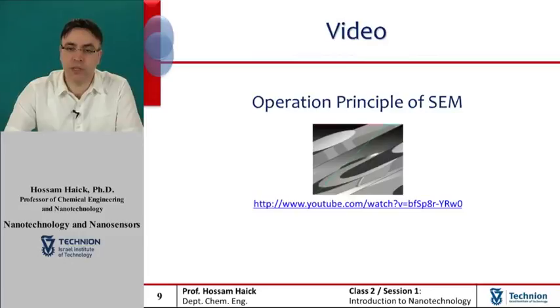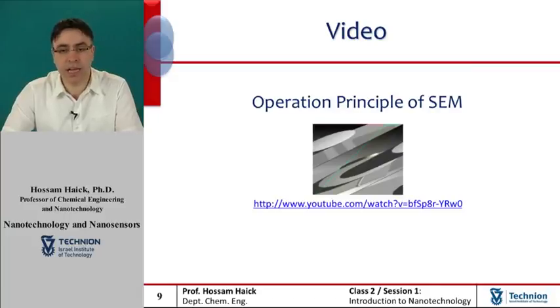Following is a short video that demonstrates the SEM operation along with an animated presentation. Please have a look and try to connect the parts described in the previous slide with the parts shown in the animated video. Enjoy.